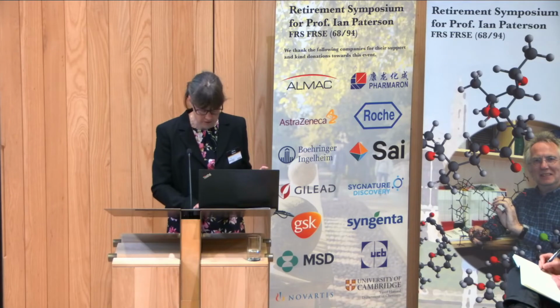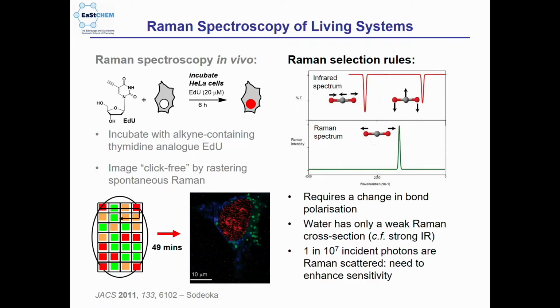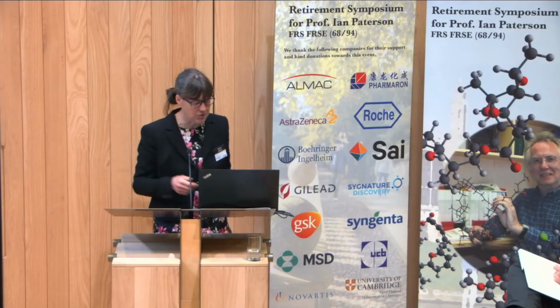This is using something called spontaneous Raman. So we all did infrared spectra, because if you want to get your molecule published in Org Lett or wherever it might be, part of your routine characterization is to take the infrared spectra. So we're all very trained in vibrational spectroscopy. And you're used to the idea that with infrared spectra, you need a change in dipole moment for you to be able to see that stretch, and that's what you record.